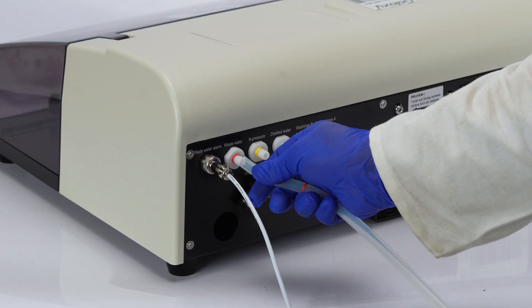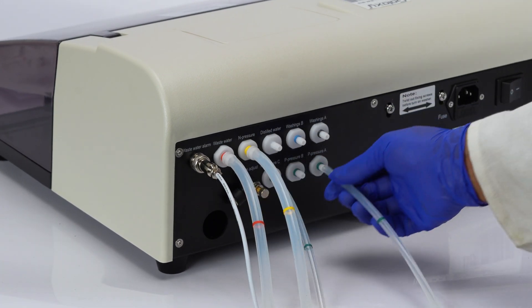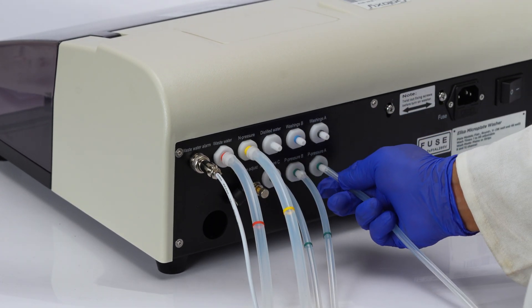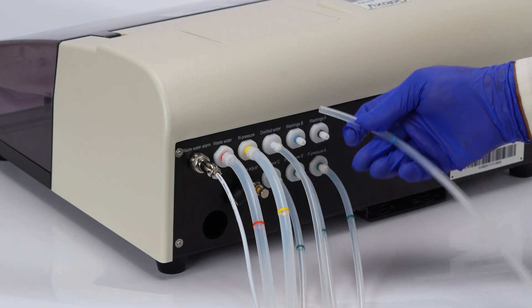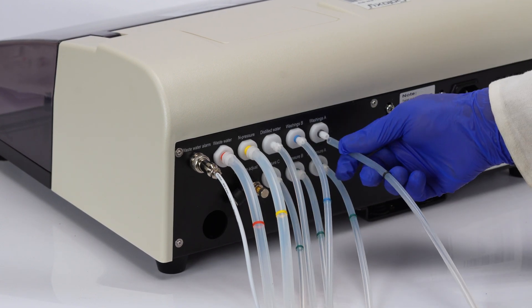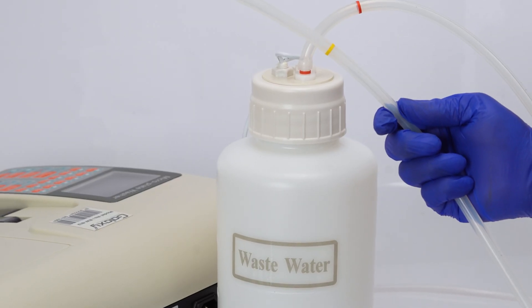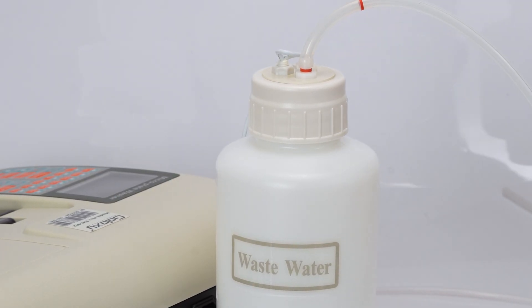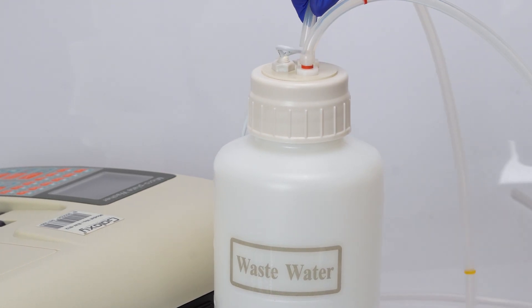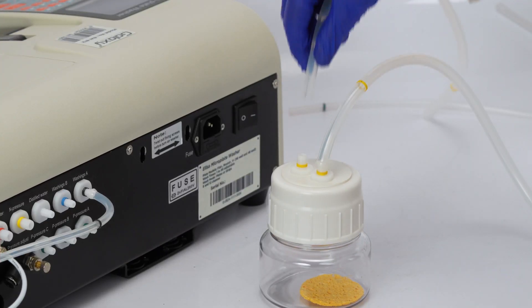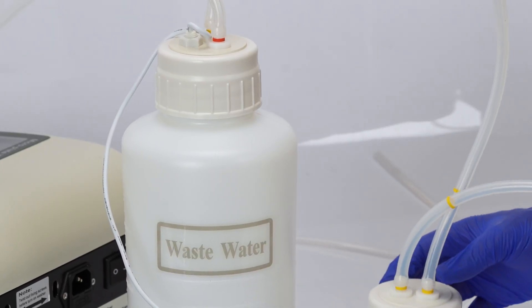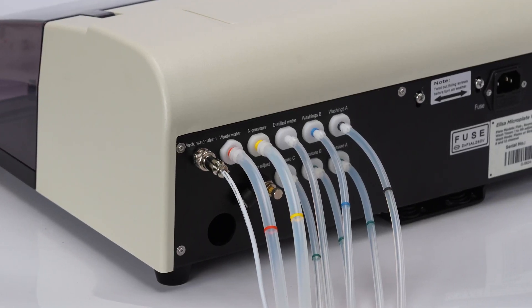Attach the solution bottles and the distilled water bottle to the washer using the color-coded pipes. Connect the waste bottle sensor and pipe, then link the pressure bottle to the waste bottle and the machine with the appropriate pipe.